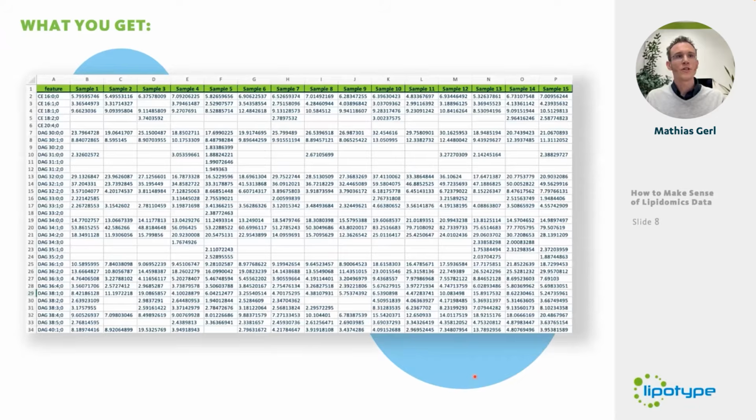Of course, what you start out with is your data sheet. That's your tabular spreadsheet of data that you get with samples on the top, and the features, which are the lipids in this case, lipid species. You might have data values in here, and you might also have values that are missing. Let's first have a look at the first column. These are your lipids.